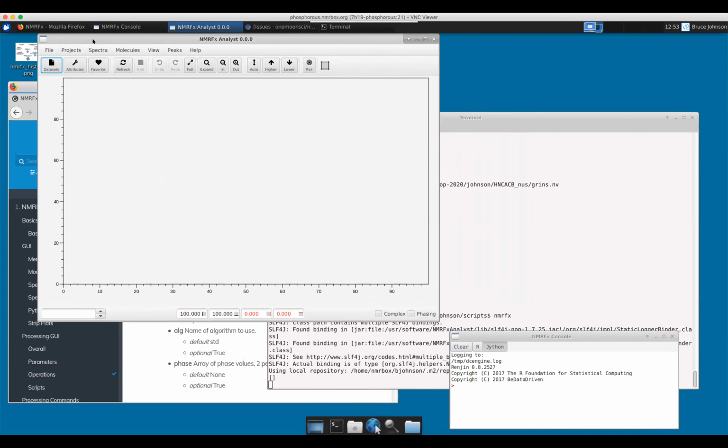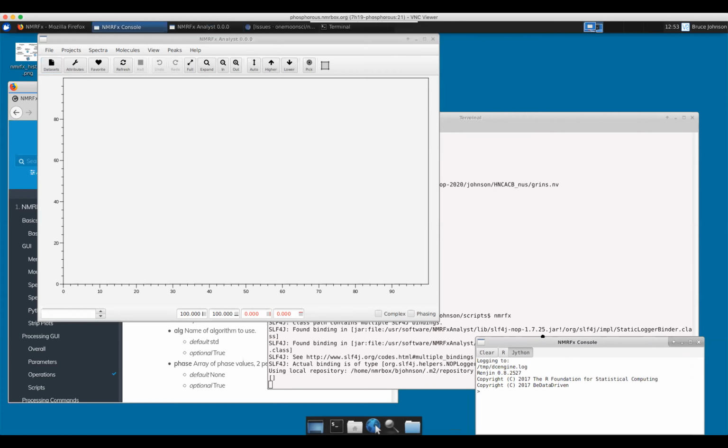I'm guilty of things being here that maybe are not as finalized as they should be, in part because that lets me demo and get feedback on things. So let's take a look and see how titration is.